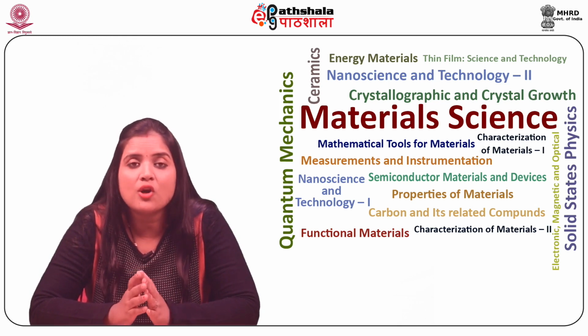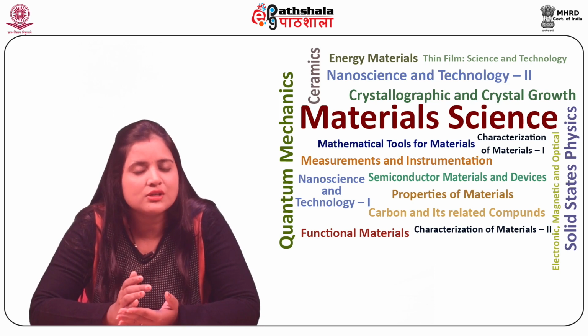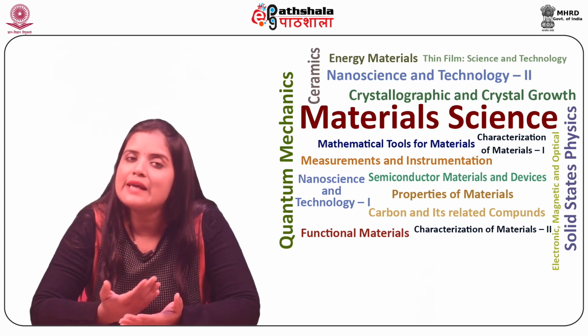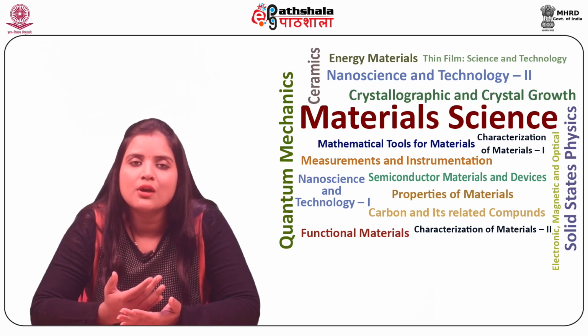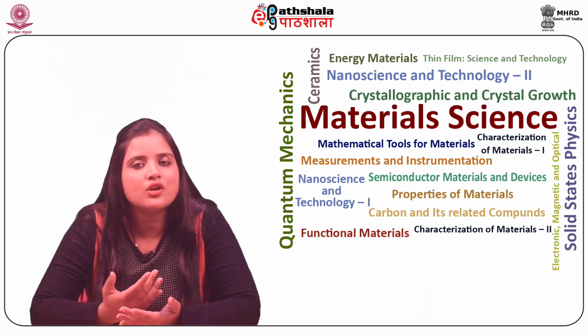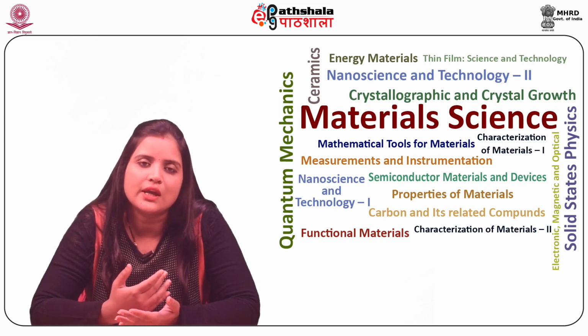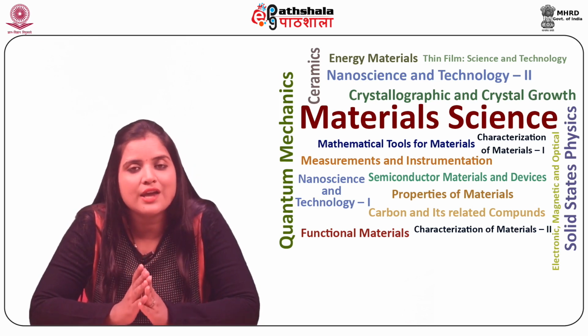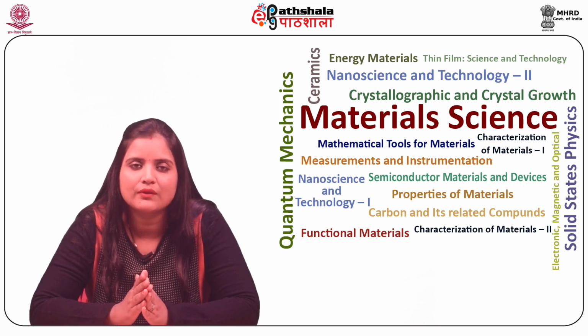Then, an important application is MEMS. Comb drive actuators, micromirrors, accelerometers, gyroscopes, micropumps, microphones, ultrasonic transducers, cantilevers, surface acoustic waves, etc. have been analyzed via digital holographic microscopes.